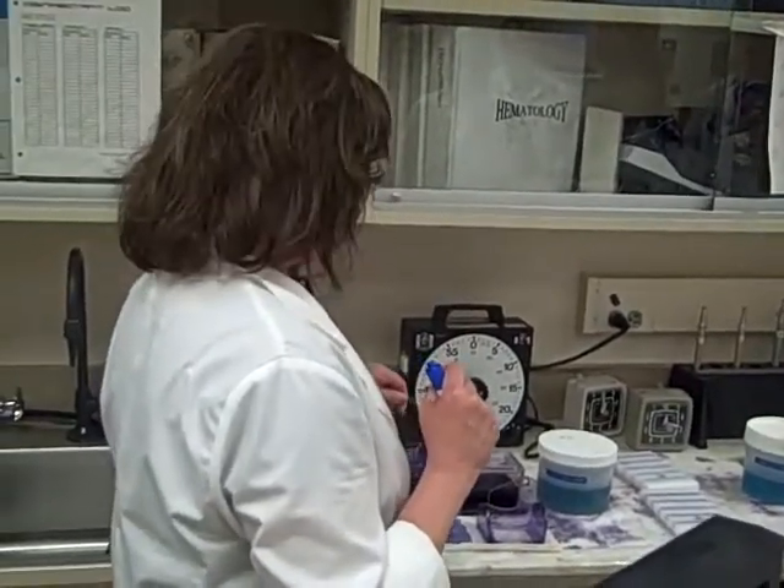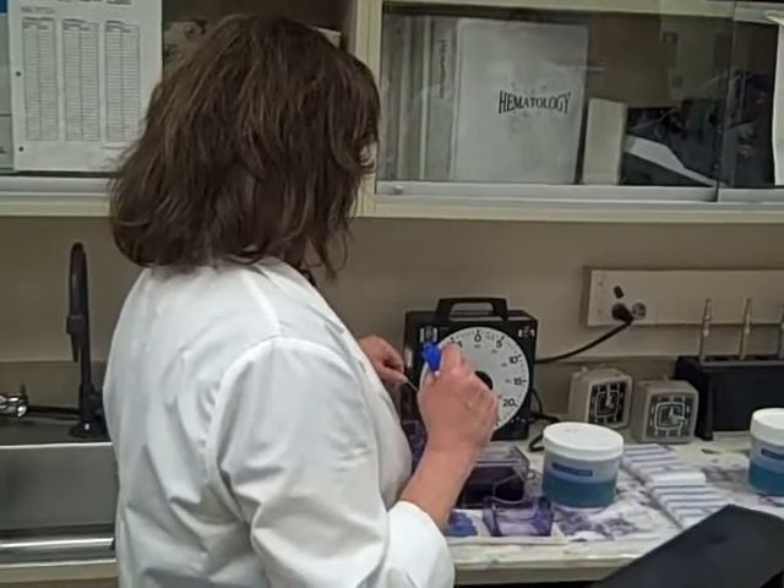So you fix for 30 seconds, take it out, blot it, it goes in the next station, which is our Wright stain station, and it stays in there for 5 minutes.